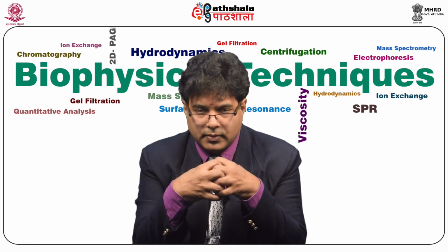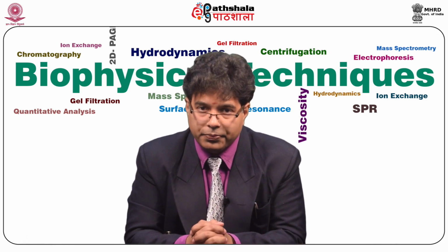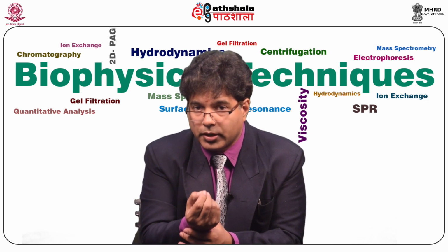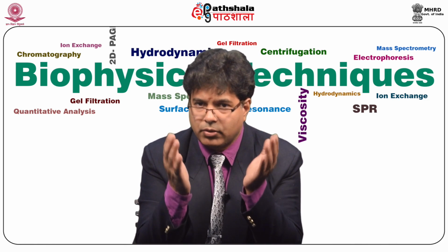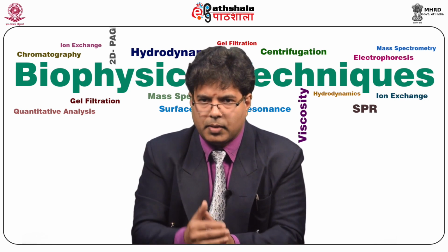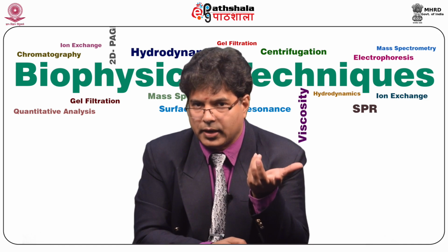Next is mass accuracy. This is a very important aspect, because we have two different classes of mass spectrometers to do this job, and the instrument used to analyze proteins cannot be as accurate when it comes to small molecular weight quantification experiments. One is qualitative, which tries to get a very high accuracy in terms of molecular weight, with a mass accuracy of 0.0001 atomic mass unit. Whereas for quantification purposes, we need only unit mass resolution, where nominal mass plus or minus 0.5 is sufficient for analytical purposes.